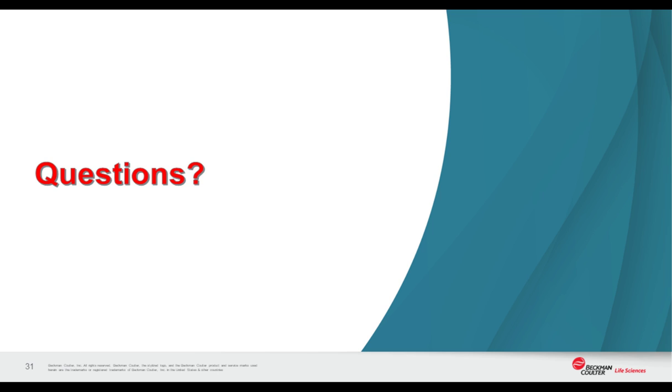Okay. Next question. Is this a diagnostic test? No, this is a research use only test and should not be used for any diagnostic purpose.